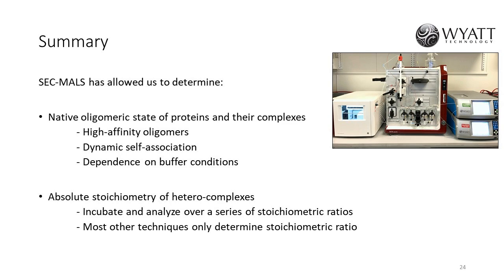Okay, thank you. Some of your chromatograms show significant aggregate present. Are you considering higher order oligomerization, or what do you make of the aggregate populations and how they vary? So the aggregates, we do not have any aggregates present in our sample. We have large oligomeric species. If we had an aggregate, it would come out in the void volume of the column, and so far the chromatograms do not have any aggregates in them.